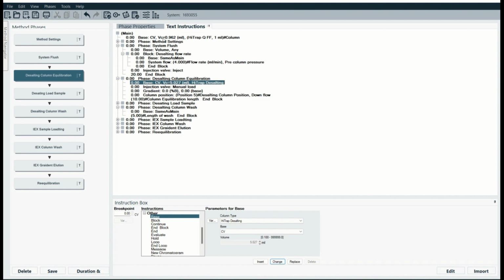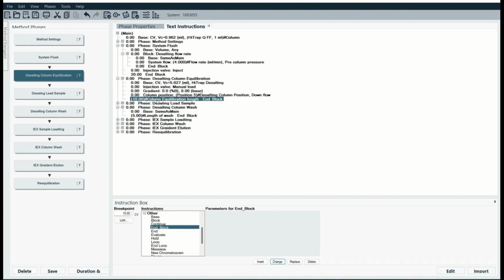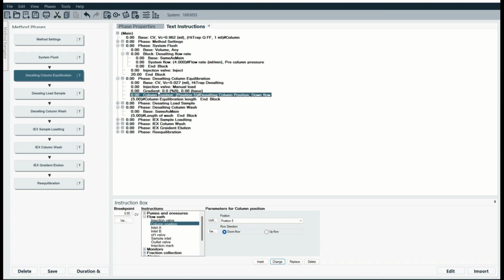Okay, good. I thought I was going to have to go through the column handling, but it tells me right there for me. Okay, so I changed this to 10. I'll be fine with 5 CVs here. That'll be fine. I thought it was going to be 10 mils, so okay. So 5 CVs there. Column position 5. Let me check my notes.